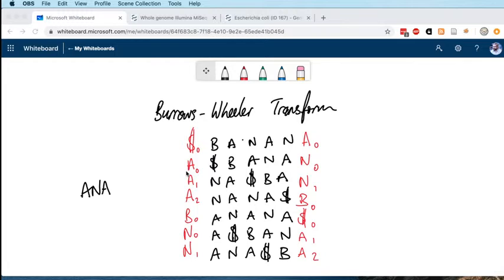And then you search your transformed reference genome, but you search it not with the whole read. So you don't take the whole read and search for an exact match for the whole read, because that doesn't allow you any flexibility. The way that you search the Burrows-Wheeler transformed representation of your genome doesn't allow for things like gaps and mismatches and stuff like that, which are all desirable when you're doing a DNA sequence alignment. So you do what's called a seed match. So you take a small section of your read, and you use that small section of the read to search the Burrows-Wheeler transformed genome to find candidate matches.